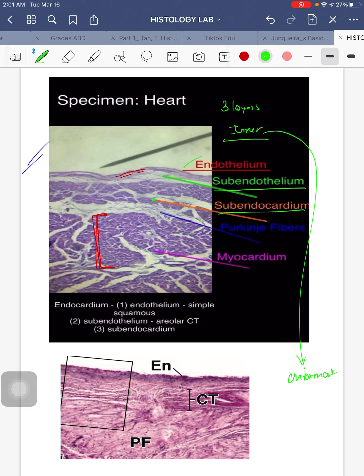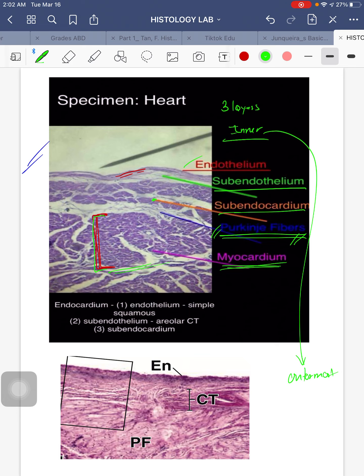The subendocardium layer is nearing the myocardium. Within this subendocardium layer, you will come to appreciate your Purkinje fibers, which is very important as it is one of the heart's impulse conducting systems. Do your best to identify and familiarize yourself with this in the pictures shown in the textbooks or atlases. Below that area you will see the thickest layer — the bulk of cardiac muscle tissue — which is in the myocardium, the middle layer.